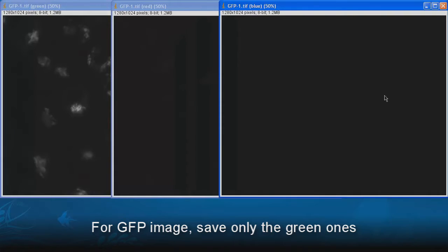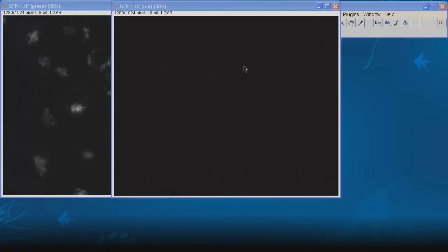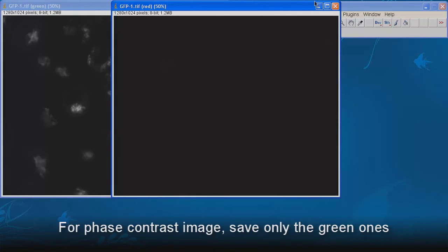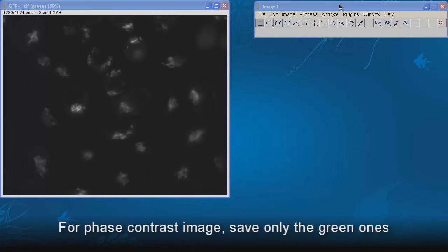For GFP image, save only the green ones. For phase contrast image, save only the green ones.